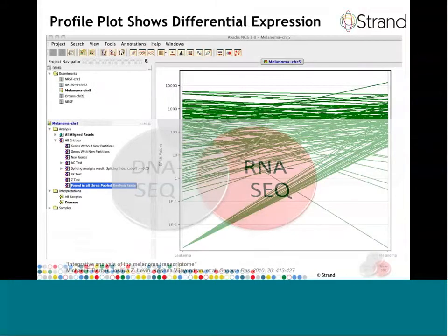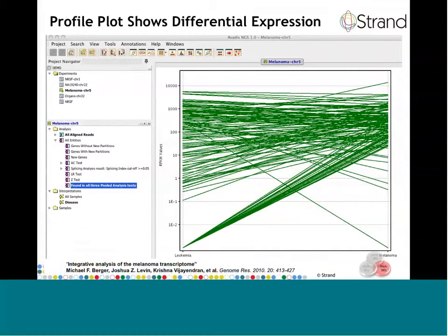For an RNA-Seq experiment, the starting point for Avadis NGS is a set of reads already aligned to the reference genome. Usually this is done at the core facility or service provider that provided you with the sequence results. If you don't have access to a core facility or service provider that can do this, we recommend some of the publicly available alignment services such as Galaxy Alignment Service. These services take a FastQ data file and can run alignment programs such as Bowtie and TopHat, the result of which can then be loaded back into Avadis NGS.